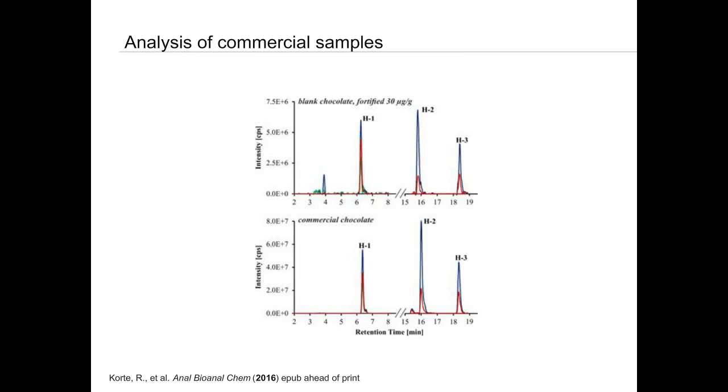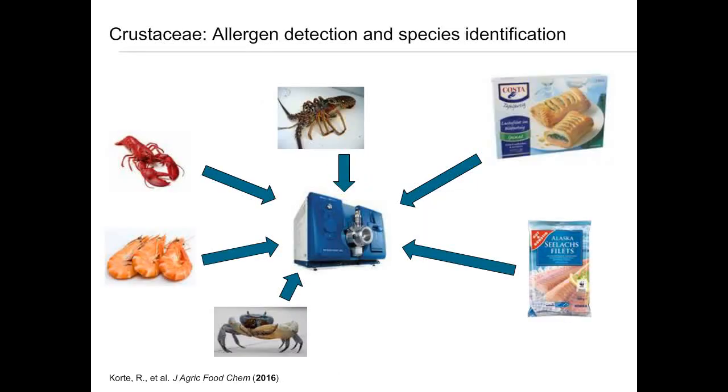But future studies, in my opinion, should also focus, and we will in future studies focus, on the matrix effect on protein levels for the allergens. So we might need matrix-matched correction factors that also take into account extraction efficiency and release of the peptides from the allergenic proteins. And this is just one of the outlooks of what needs to be done if we want to end up with really absolute quantification, not only detection of allergens, but really absolute quantification of allergens in food. We need to take into account these aspects.